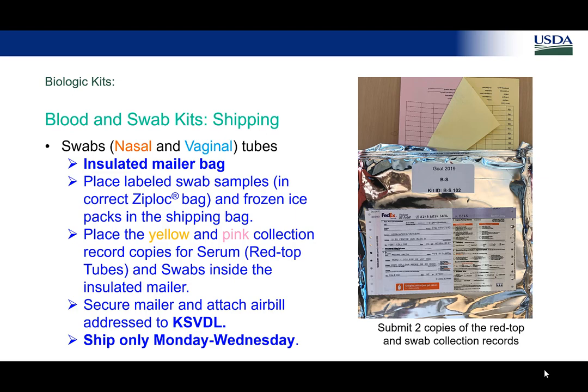So you want specific ones, the ones that appear red? Well, you have to do five of the same. What did they say about the crossbreed? They're interested in that, right? We can mark that. An option is crossbred, but I think the more valuable information would probably be from the purebred. So if they have those available, I would take from those. Unless a producer really wants to know specific information on one of those goats, then it's really up to them, and you can get that scrapie genotype resistance information for them.